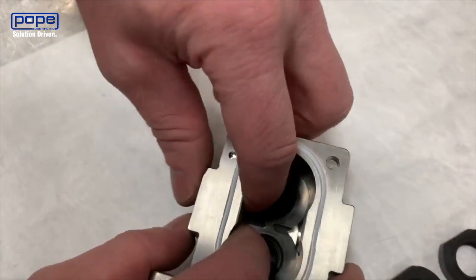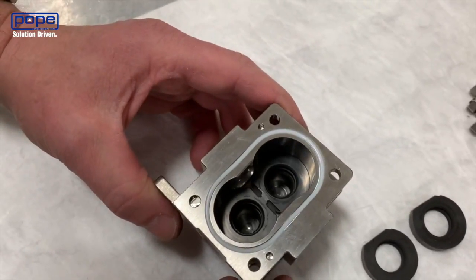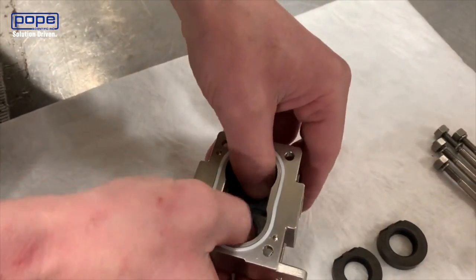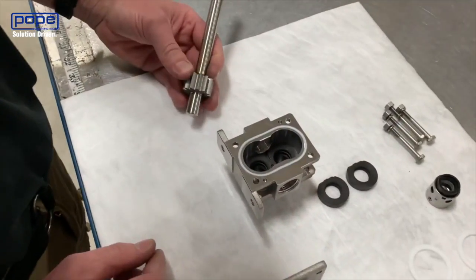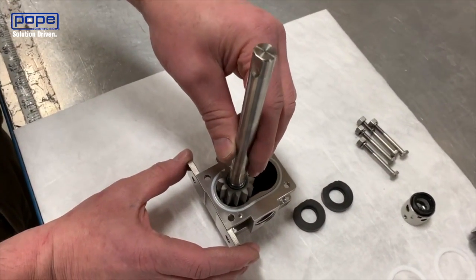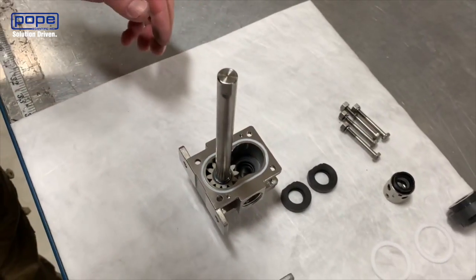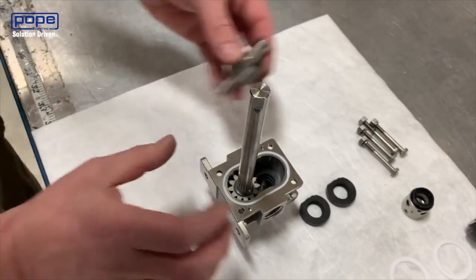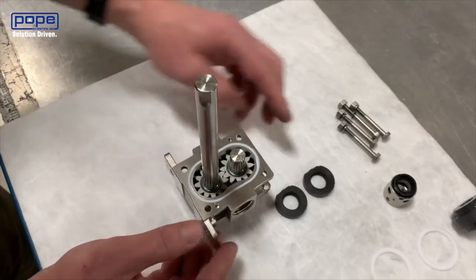You'll also notice that the relief grooves are on the center side of the center housing, so they're facing inwards. Next we're going to install the drive shaft with the drive gear — we're going to install this in the bottom of the pump, on the same side as the feet. Then we're going to install the idler gear, and that's going to sit on the other side.